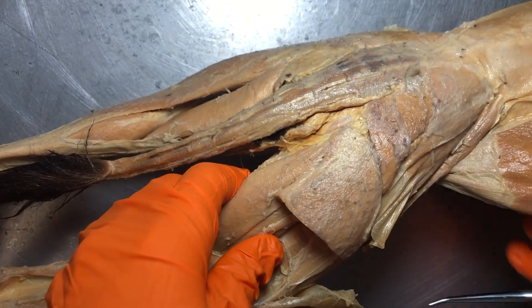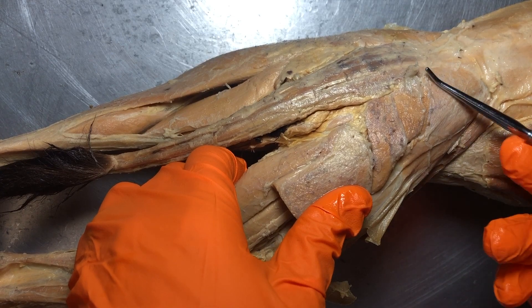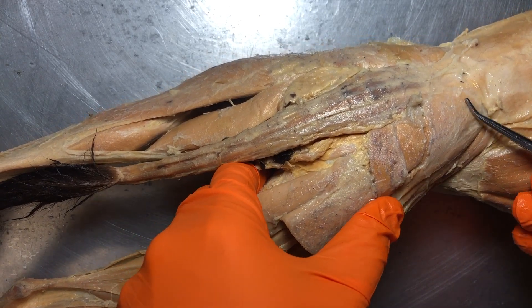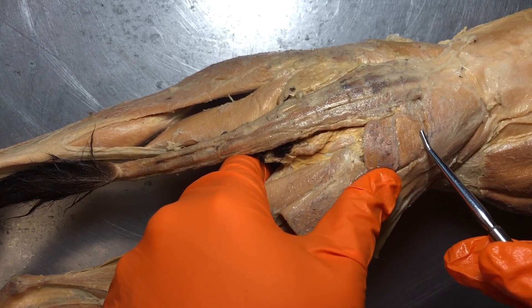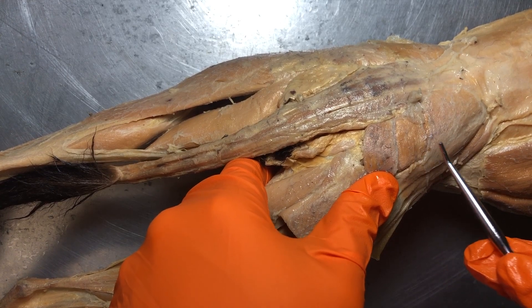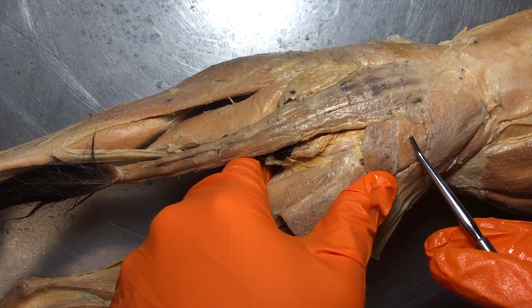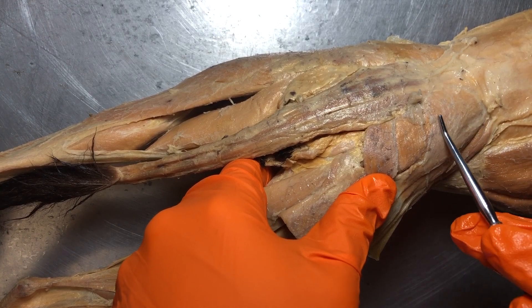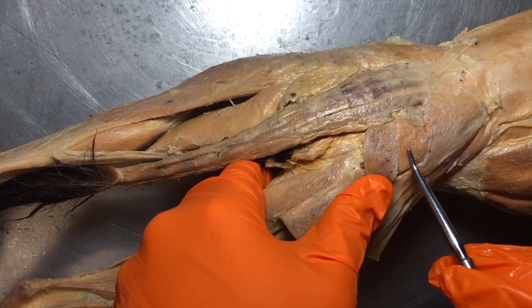Starting anteriorly and moving posteriorly and inferiorly down the lower extremity: the first muscle is the gluteus medius right here — you can see that kind of runs on the sides as it does for us. On kitty cats it's a little bit different. This smaller muscle right here is actually the gluteus maximus. So pay extra attention whenever we have something different from what we have in humans, so it doesn't trick you. This large one right here is the right gluteus medius, which makes this the right gluteus maximus.